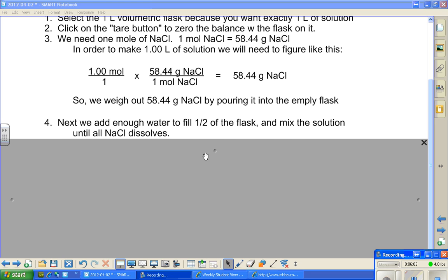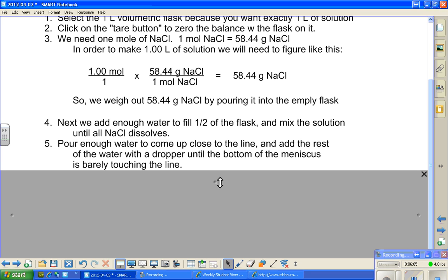So we added enough to make half-full. Then we pour enough to come up close to the line and add the rest of the water with a dropper until the bottom of the meniscus is barely touching the line.